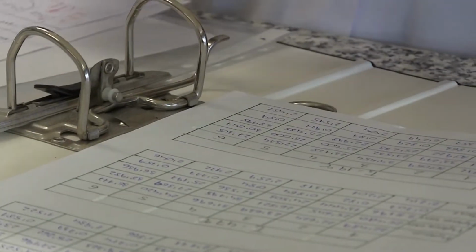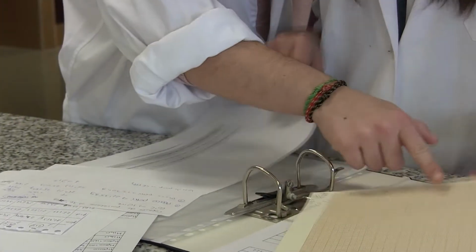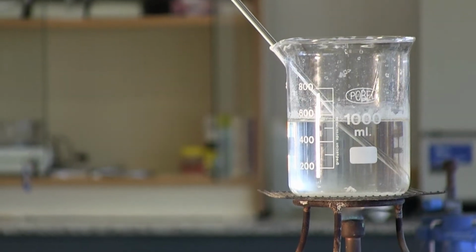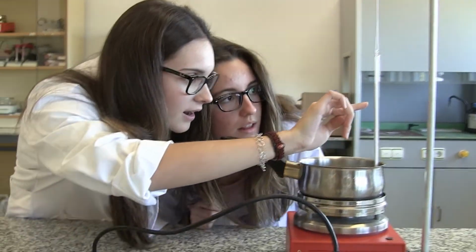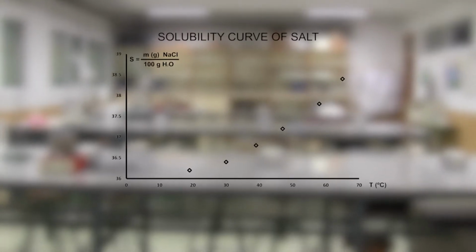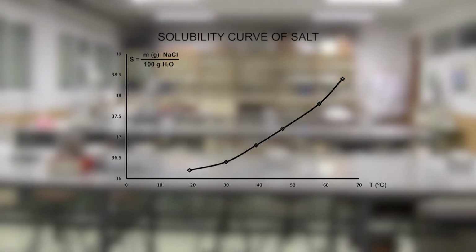In our project about the crystallization of sodium chloride, the first thing we have done is to determine the solubility curve of salt. We have to measure the amount of grams of sodium chloride that can be dissolved in 100 grams of distilled water at a particular temperature. Although the solubility depends on several factors, in the case of sodium chloride the temperature is not an important factor, as we can appreciate in the solubility curve.